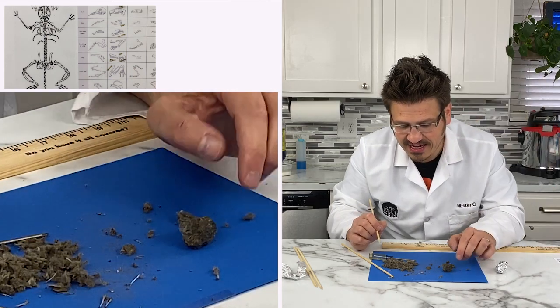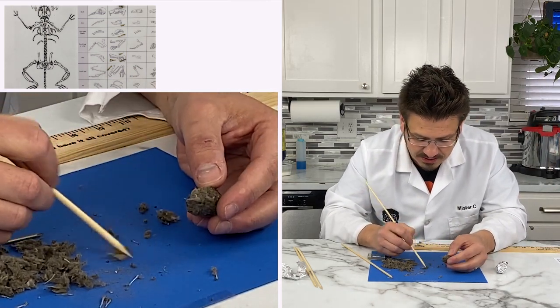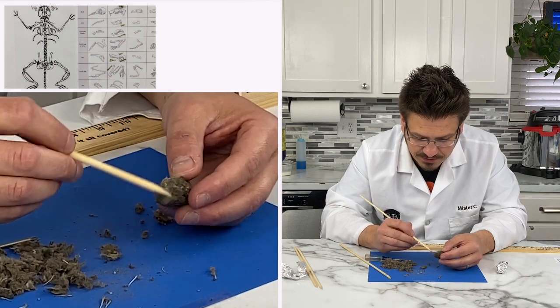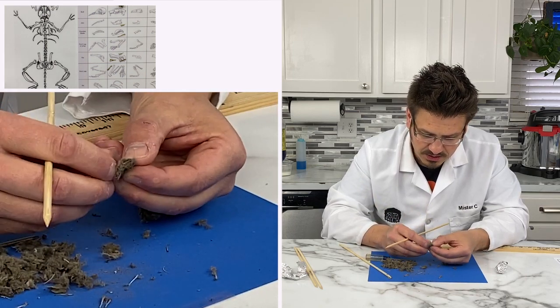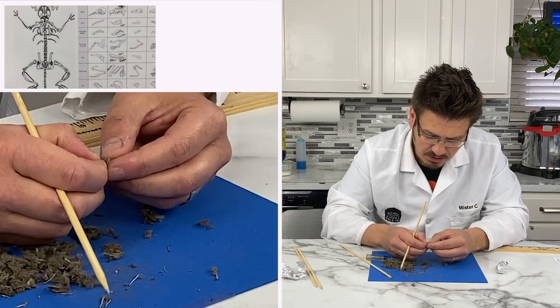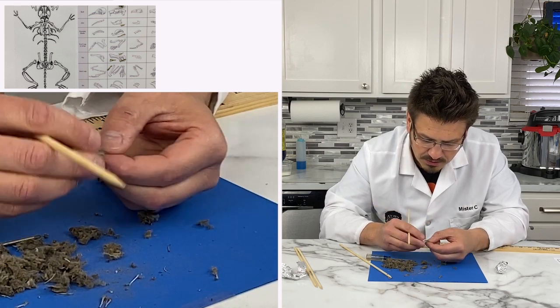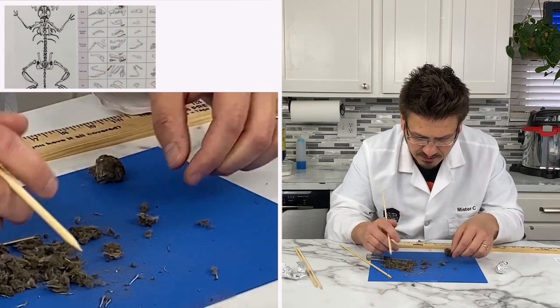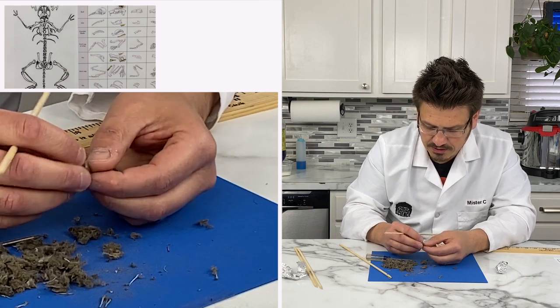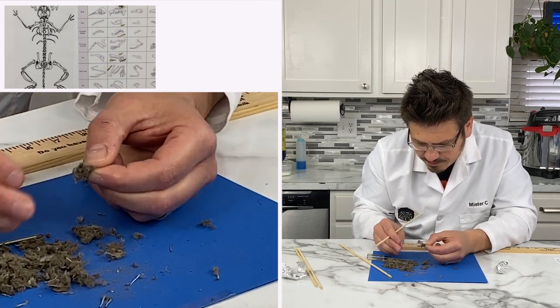You know what we haven't found any of? Our vertebrae, so the backbone. But the ribs are just popping out left and right. Here we go. Oh man, what's this? I think that's part of the skull, maybe? No, I'm not sure what that was, if anything. All right, here we go. Gotta just go through it.